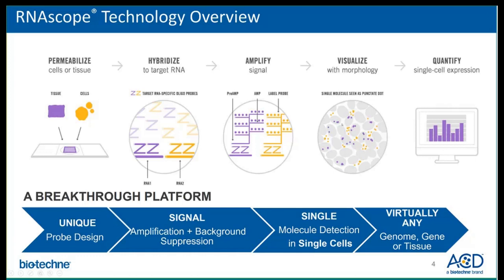These dots can be viewed under a light microscope or a fluorescence microscope, depending on the label probe used. And they can be quantified on a cell-by-cell basis, which is covered shortly.